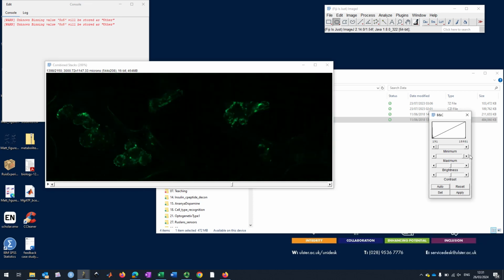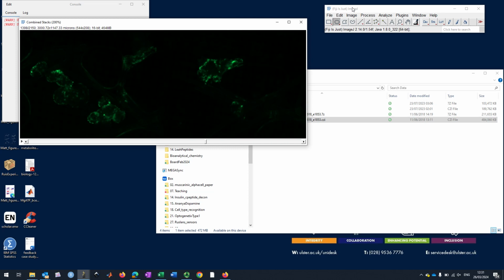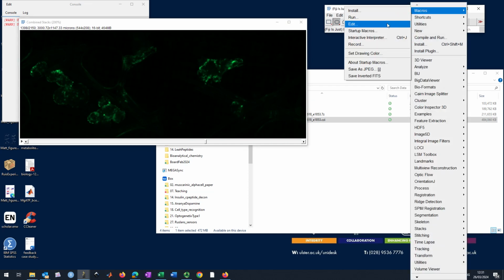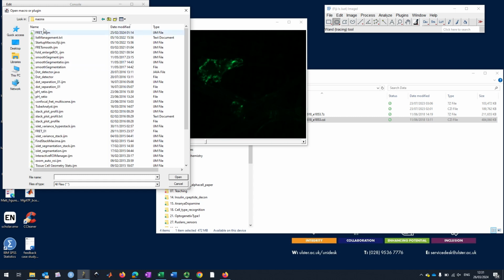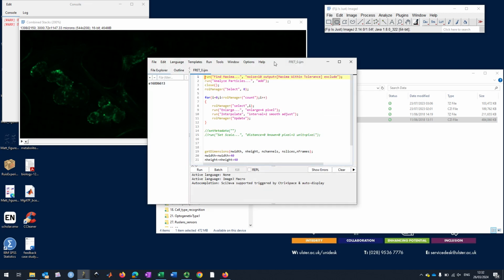What we do now to correct for the motion, we do two following things. They may not look very logical to you, but nevertheless. I have a macro, a set of very simple commands that I will be using, which is quite helpful.